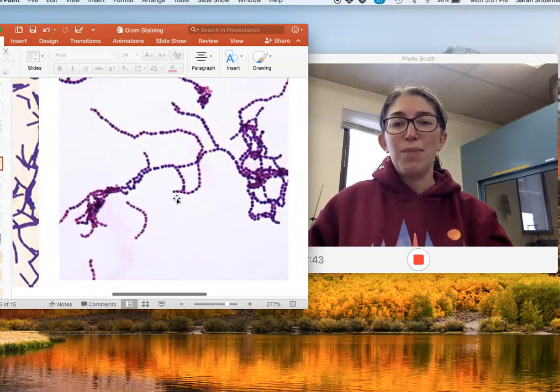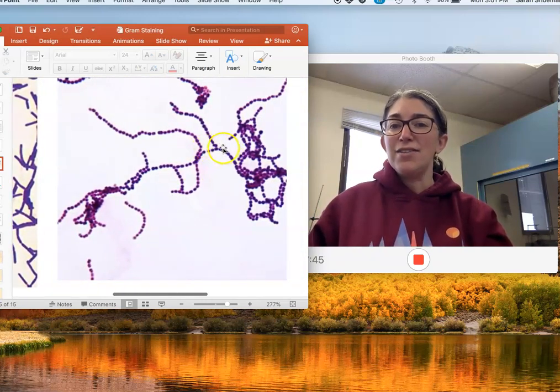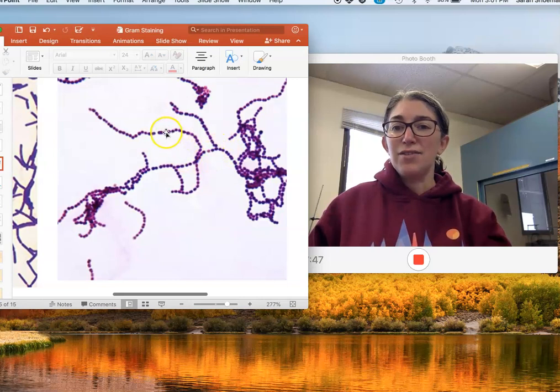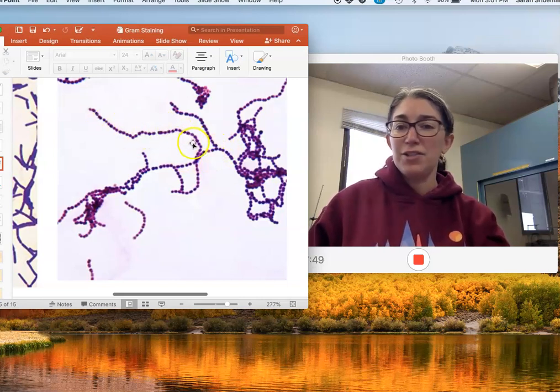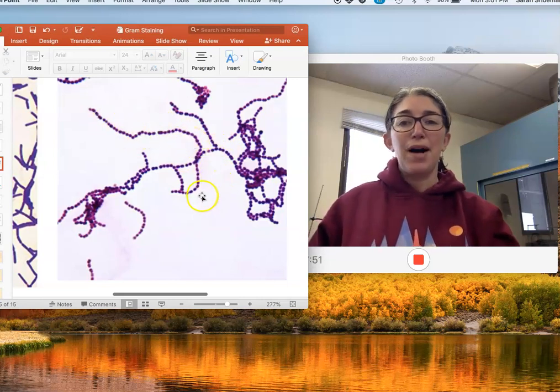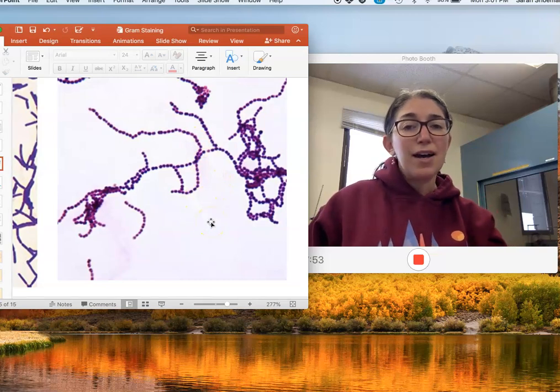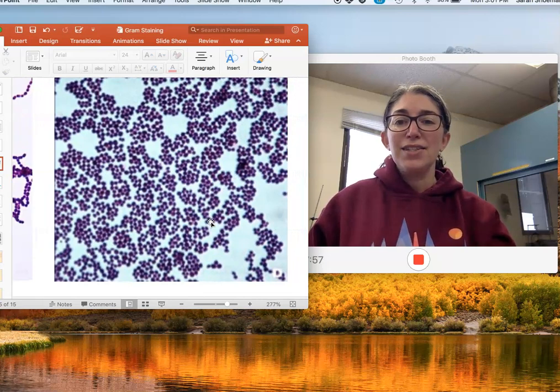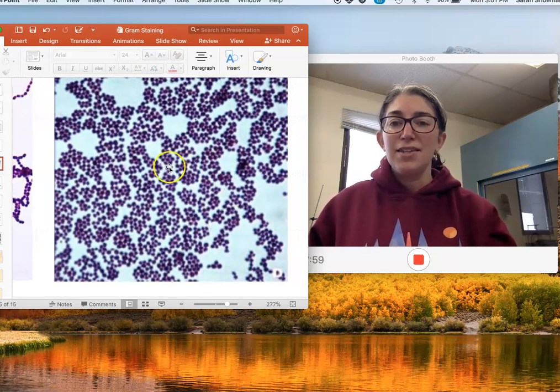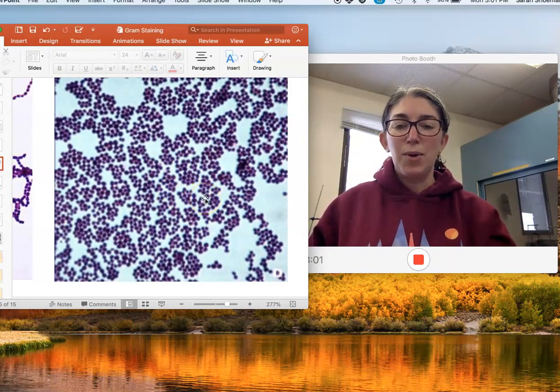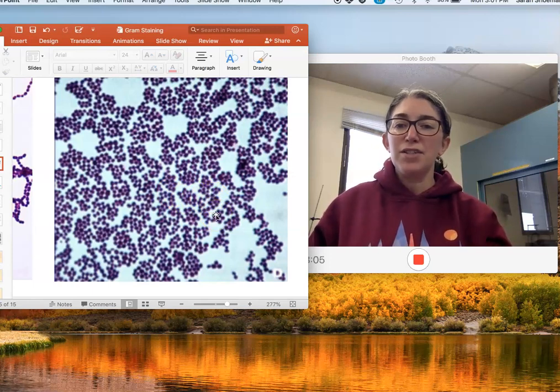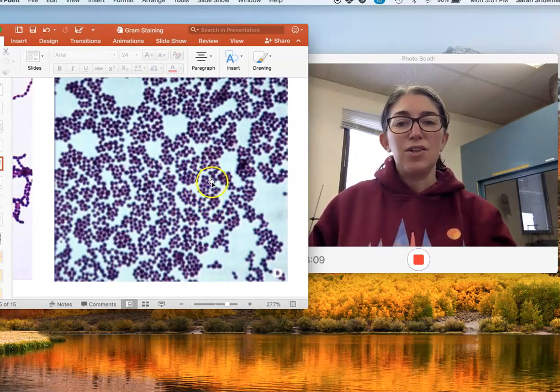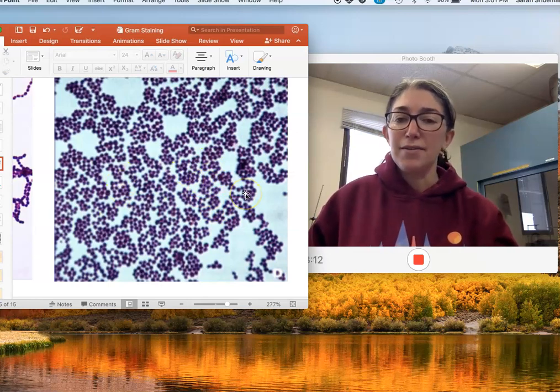Here are some streptococci — cocci, so you can see little circles, they're round and they grow in chains. These would be gram positive streptococci. And here we have some gram positive staphylococci — the resolution is kind of poor when zoomed in, but you can see they have that grape cluster kind of look. They're like little balls that grow in little clusters — they look like little berries.